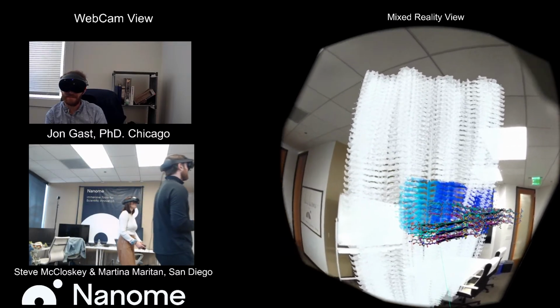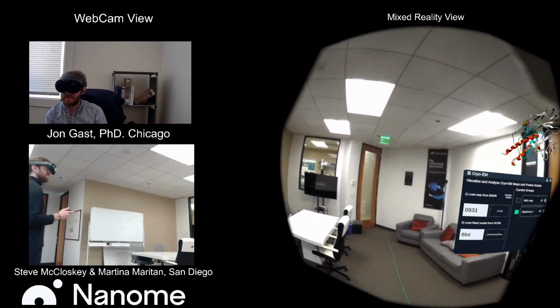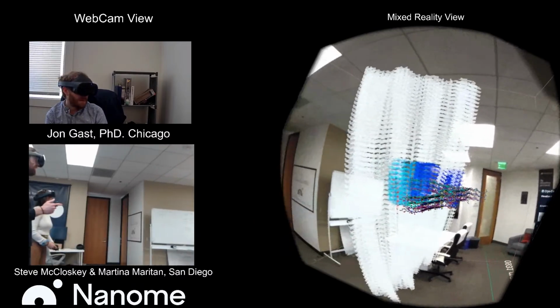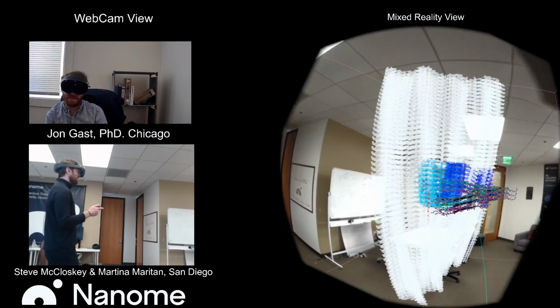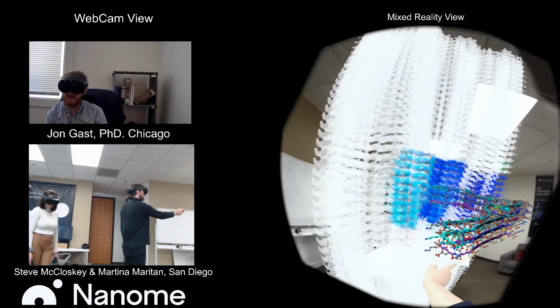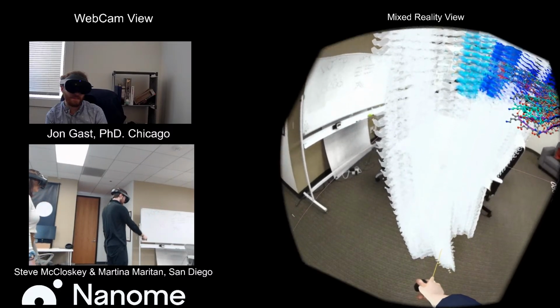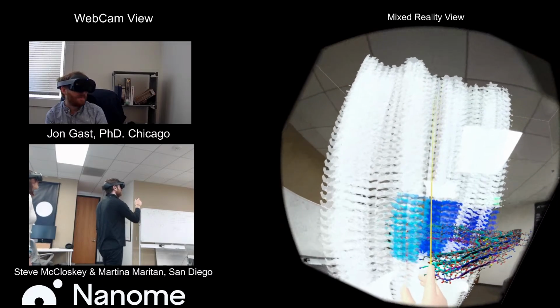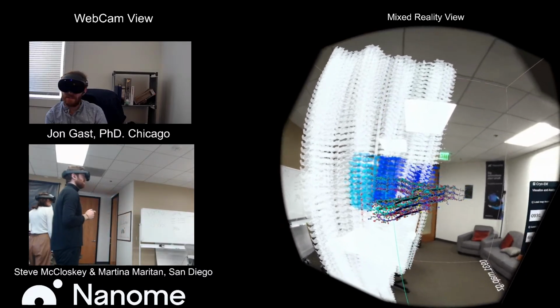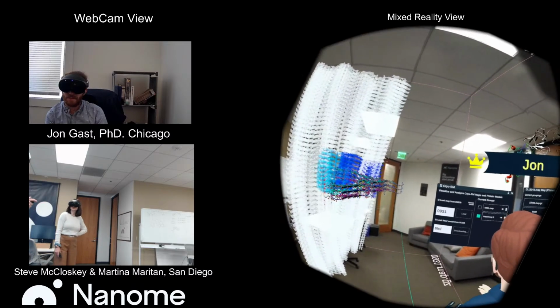I'm just going to do a little walk around. I think you moved it. That's all right. There we go. Okay, so we have the original structure over here, and then we have the new one that we just imported, taking up the entire office right now. Pretty cool.